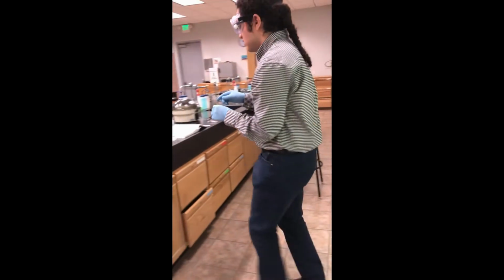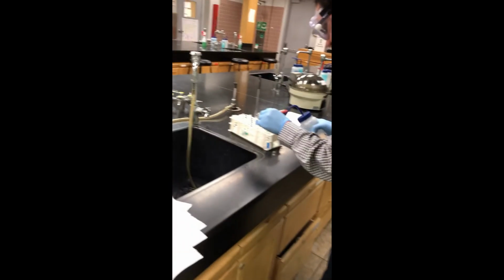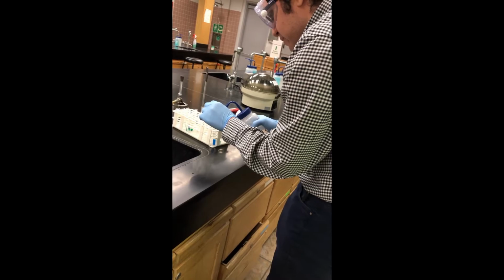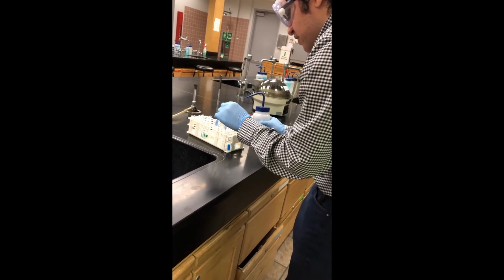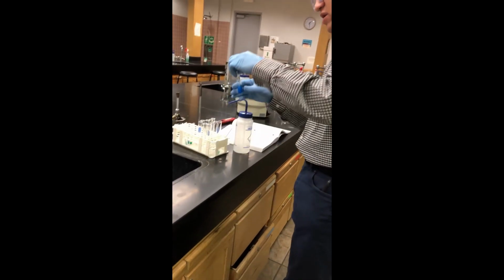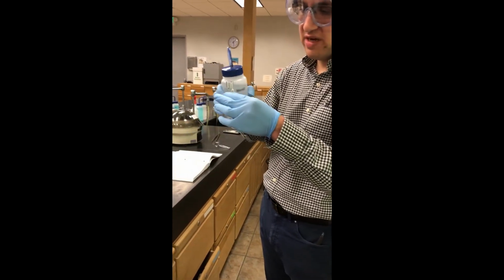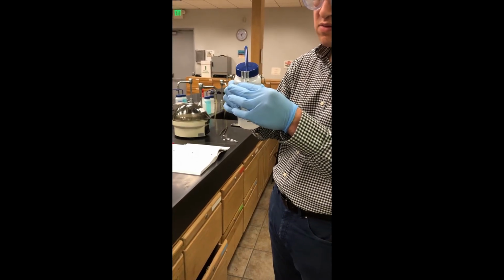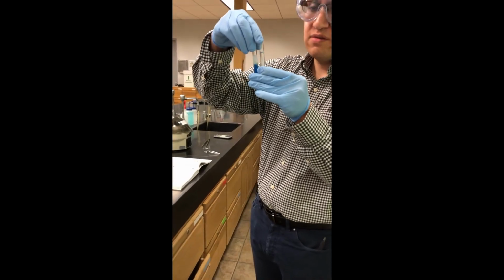And then let's rinse into our test tube. Okay, perfect. We're now going to load our 2 balanced test tubes into the centrifuge. I'm going to add a little bit of water to the test tube on the left.